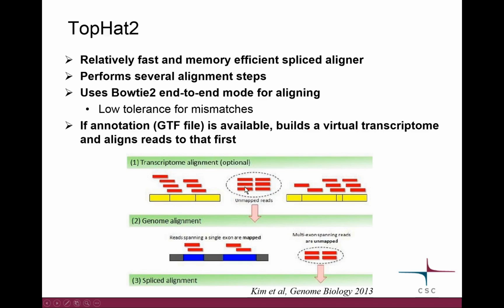It can construct the transcripts from that. So before it goes to the actual matching to the genome, it matches the reads to the transcriptome, which it has made. And of course, many reads map at this point, which is good. Those locations are then converted back to genomic locations.